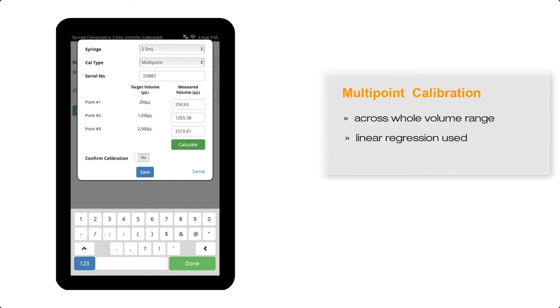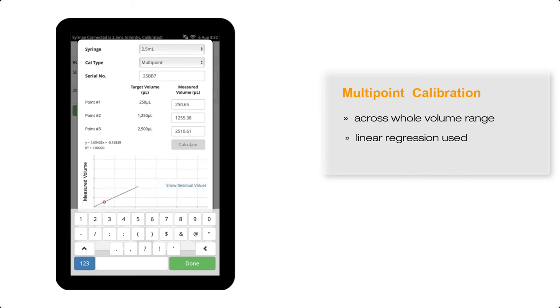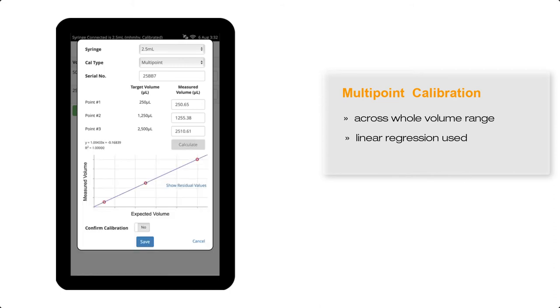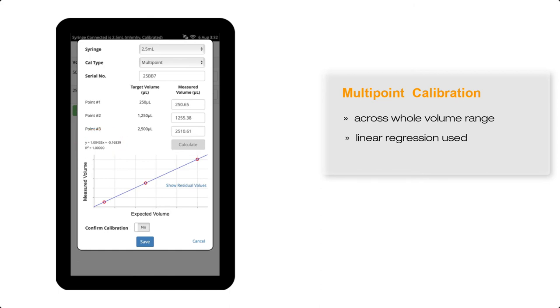The calculate button turns green and is now active. Once this is selected, a graph displaying the calibration points together with the linear regression equation and the correlation coefficient, r-square, is shown. An extra point of 0,0 has been automatically included as a calibration point.